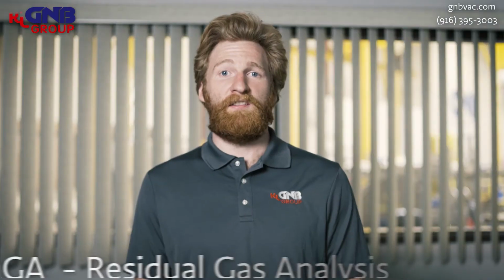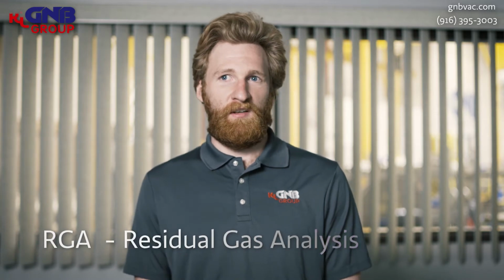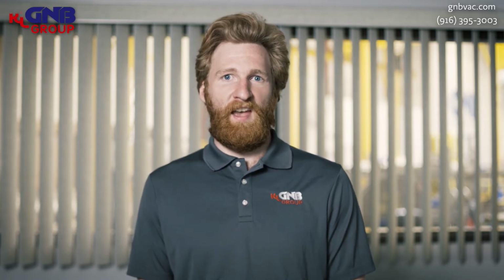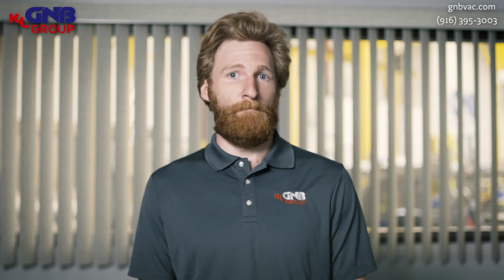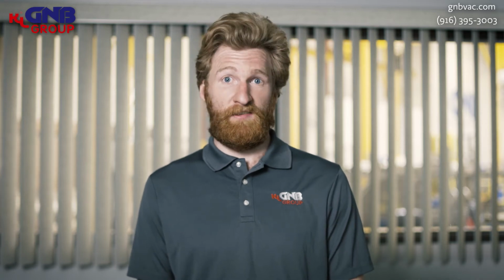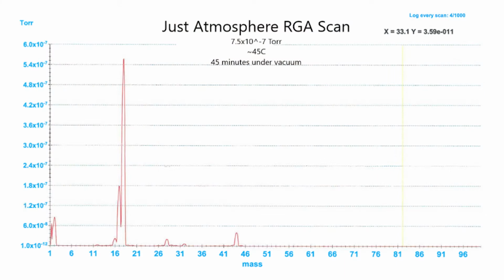Now, RGA stands for residual gas analysis, and basically what it does is it smells the atmosphere inside a vacuum and breaks down the makeup of that vacuum based on the mass of the gas species that are present. So let's take a look at a scan from what is typical atmospheric makeup.